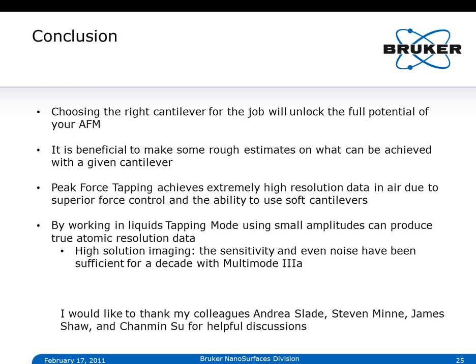And the other difference is that in tapping mode, you're using the cantilever also to establish feedback. If your cantilever gets sucked in by the adhesion layer, it's game over, right? You can have a hydrophilic surface and say, oh well, I can use really small amplitudes to keep my force down. And I showed you the formula. Of course, if you keep your amplitude down, your force is down.